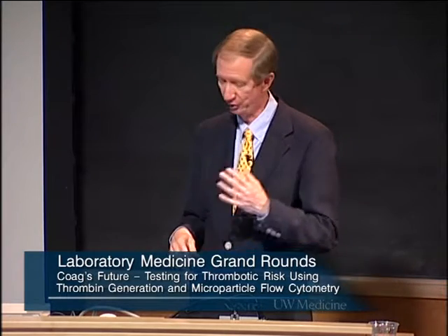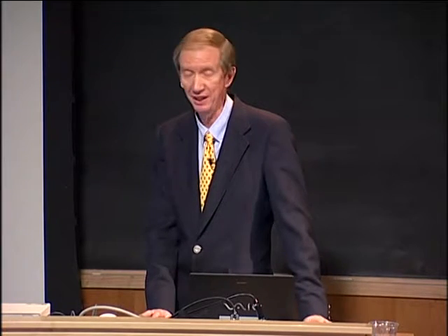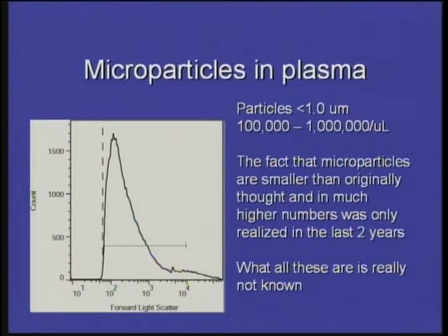And we're starting to work through the issues of trying to figure out how many of them are endothelial microparticles or red cell microparticles, if it was like an old unit of blood, or from any of the other cell types. So it's really kind of one of these new things where you've stepped onto the shore and nobody really knows what's in here, and you don't get to see that very often in science. Usually we're chewing away on something.